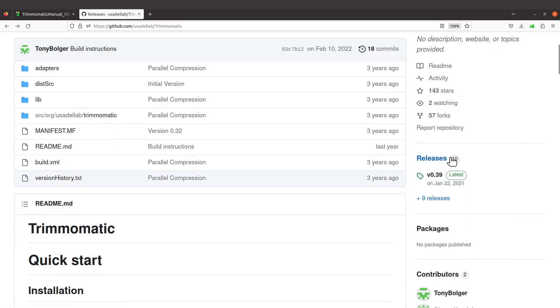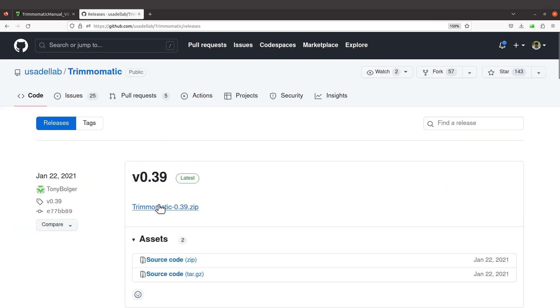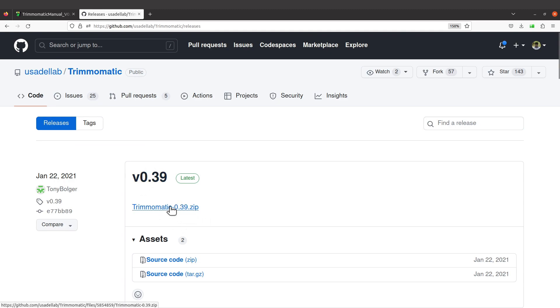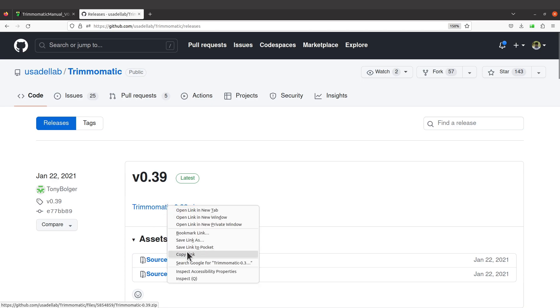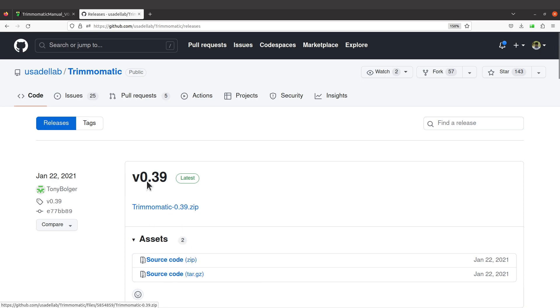When you're on this page, at the top right side you'll find releases. I want us to use this one, so click on releases and you'll be sent to this page. This is the latest release. What we have to do is download this zip file. To download you can click it, but I'll download on my terminal, so I'll right-click and copy the link, and then move to the terminal.